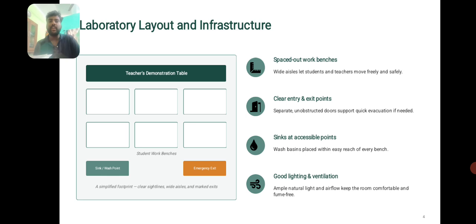Next, laboratory layout and infrastructure. Laboratory layout and infrastructure is a very important point to set up, plan, or design a laboratory. First of all, spaced out workbenches. That means wide walking paths so that teachers and students can move around safely. Next, clear entry and exit points.